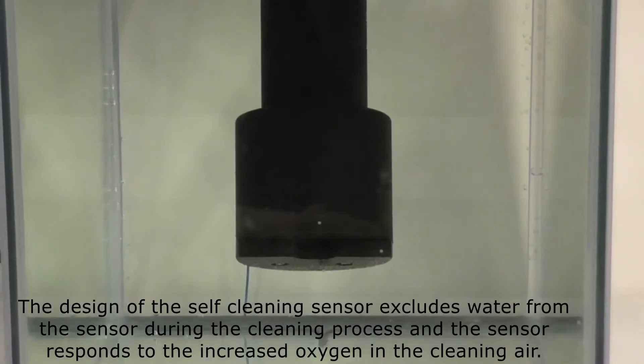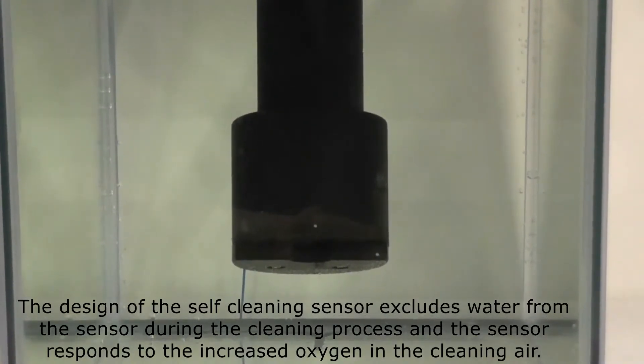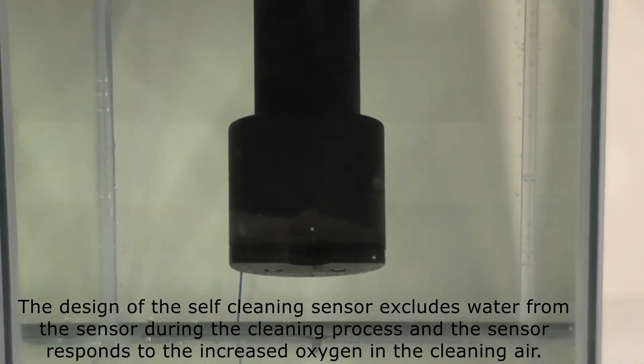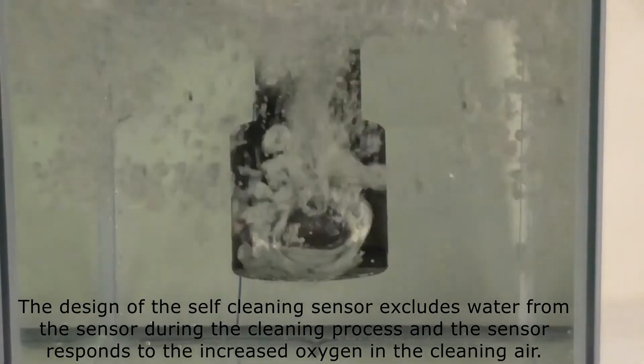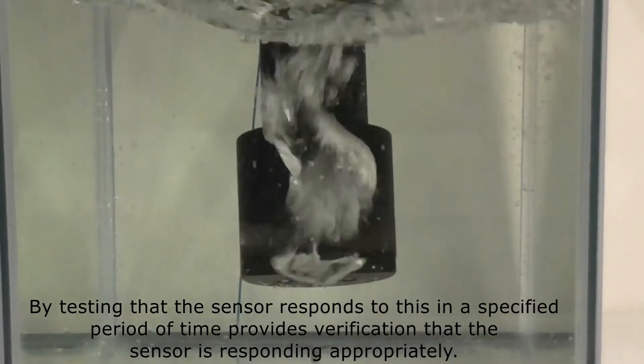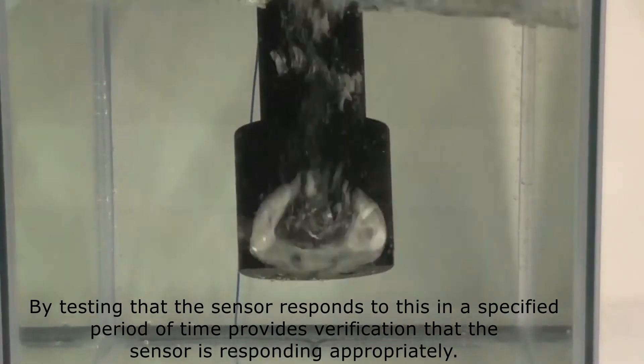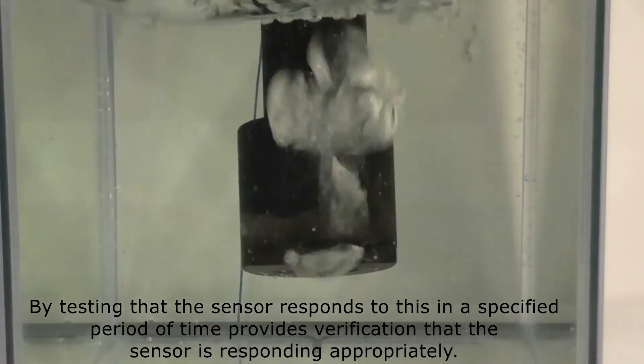The design of the self-cleaning sensor excludes water from the sensor during the cleaning process, and the sensor responds to the increased oxygen in the cleaning air. By testing that the sensor responds to this in a specified period of time, it provides verification that the sensor is responding appropriately.